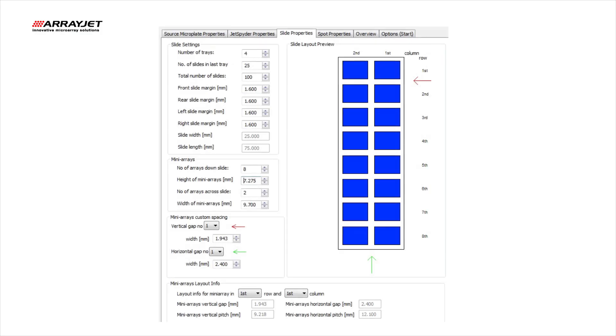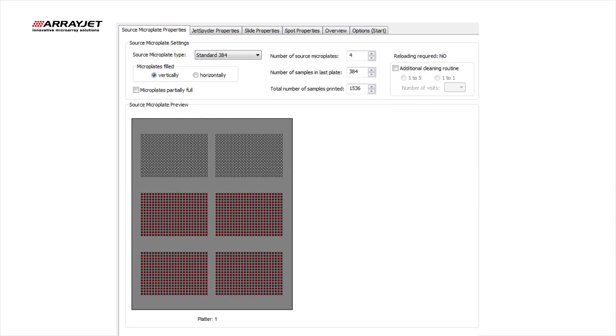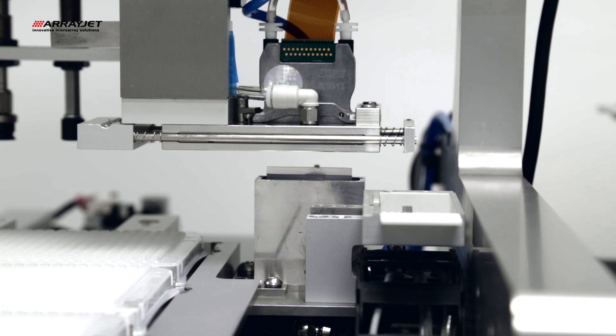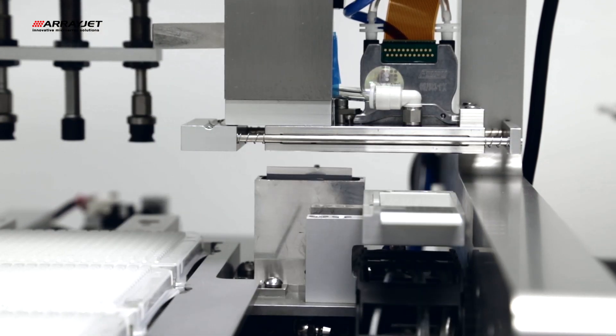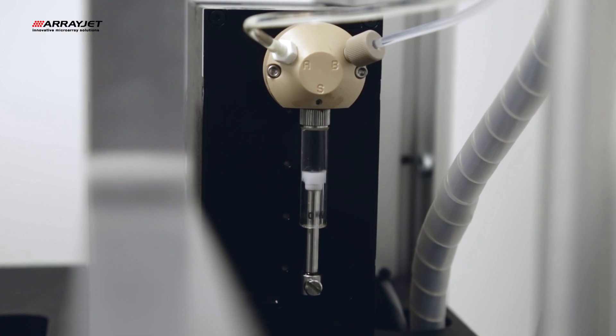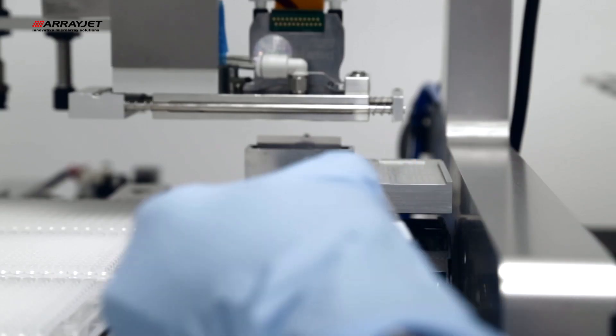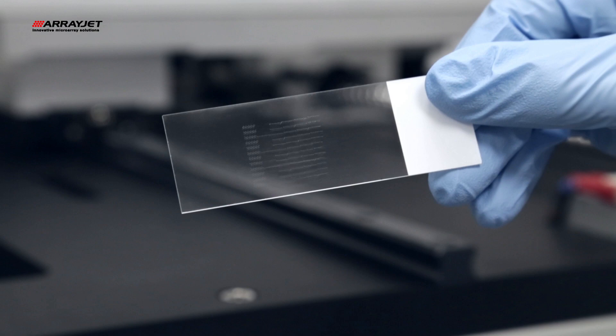Setup and testing of ArrayJet microarrayers is simple, intuitive and user-friendly. Here, a test slide is loaded by a microarray user who runs a test protocol using system buffer in just a few seconds. A visual inspection confirms that each printing nozzle is fully functional.